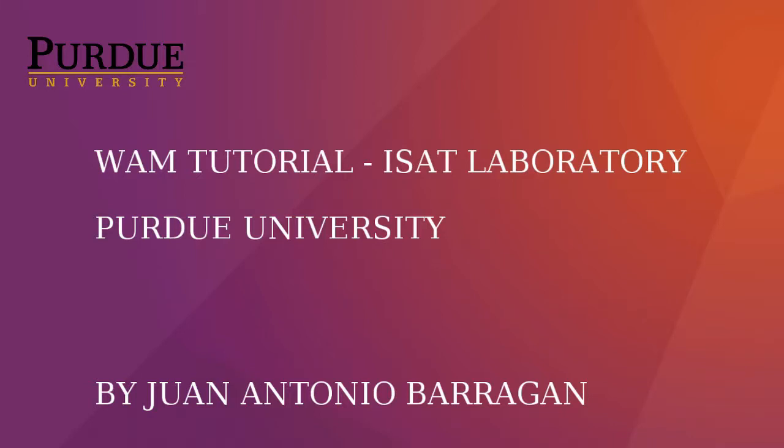Good afternoon. The following video will give a short explanation of how to set up the WAM robot, both the hardware and the software. Before starting this tutorial, it's very important that you make sure that your computer and the WAM robot are connected to the same router, because the way we will be communicating with the WAM robot is through an SSH connection.